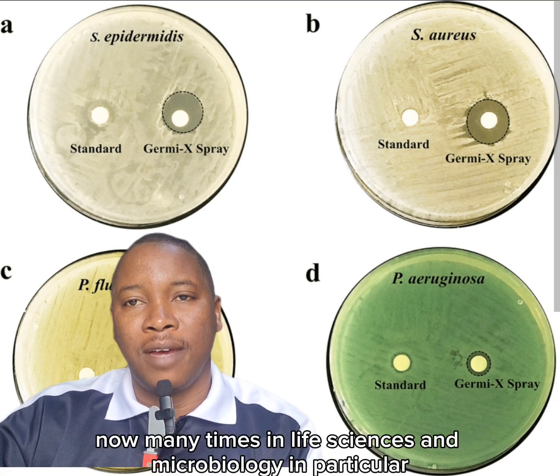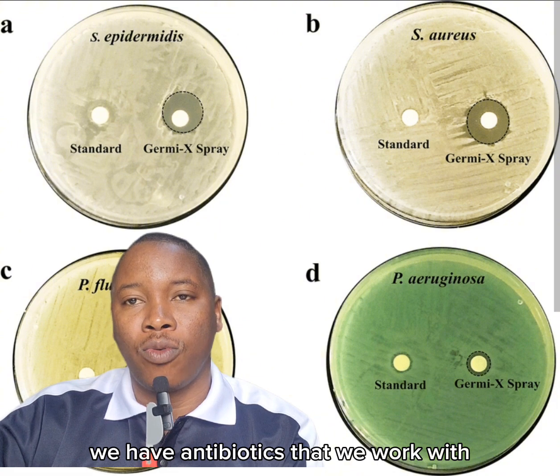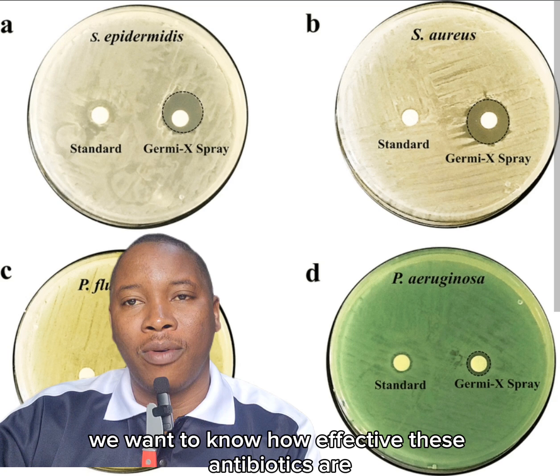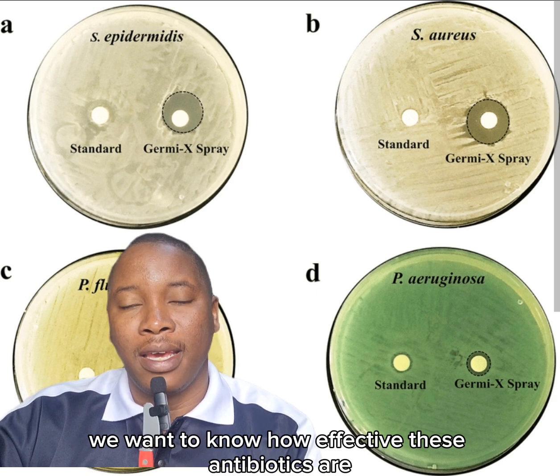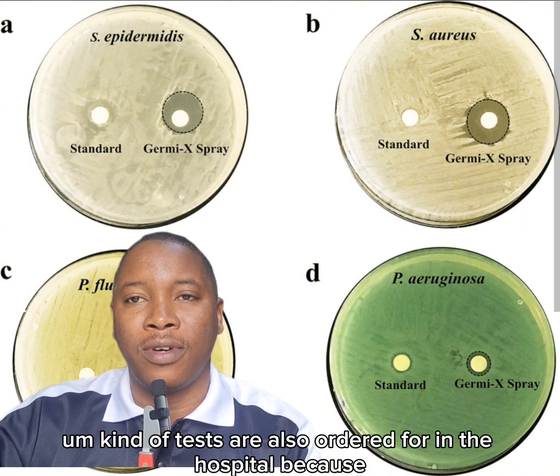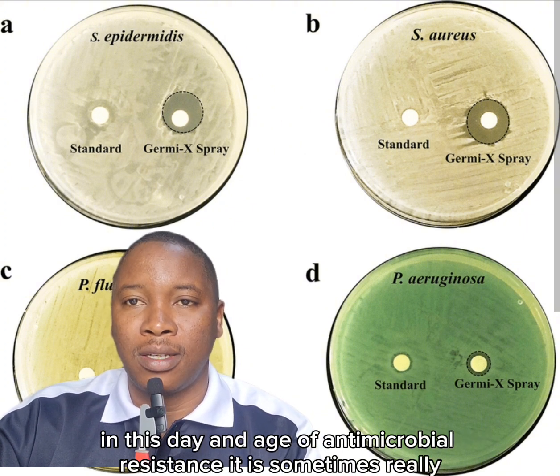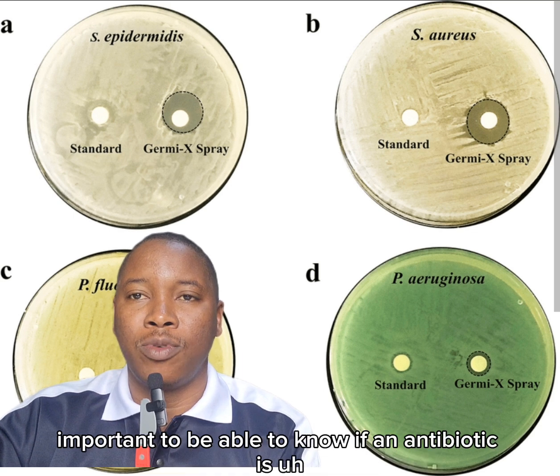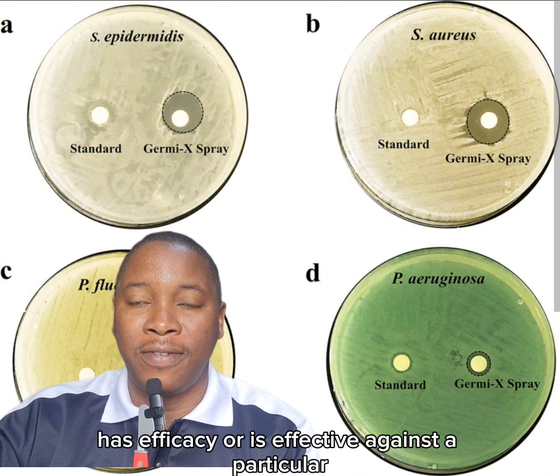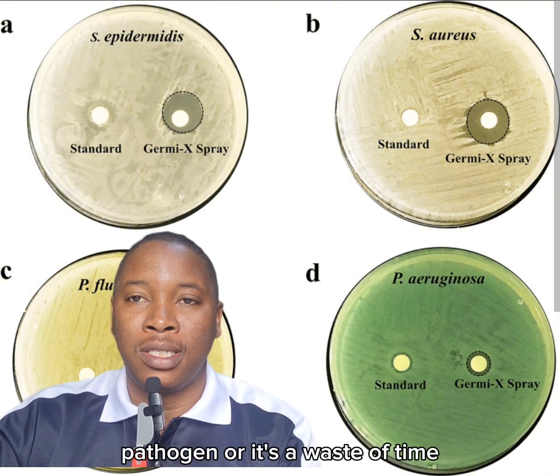Now, many times in life sciences and microbiology in particular, we have antibiotics that we work with, and many a time we want to check the efficacy. We want to know how effective these antibiotics are against pathogens of interest. And these kinds of tests are also ordered in the hospital because in this day and age of antimicrobial resistance, it is sometimes really important to be able to know if an antibiotic has efficacy or is effective against a particular pathogen, or it's a waste of time.